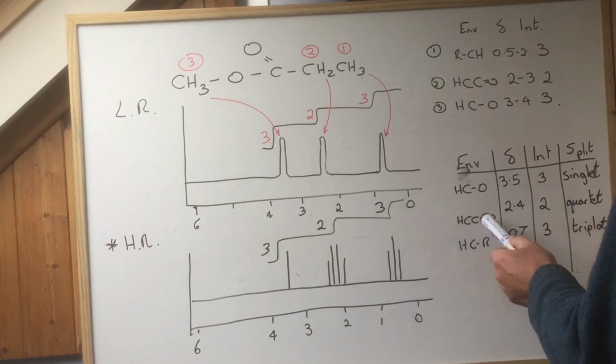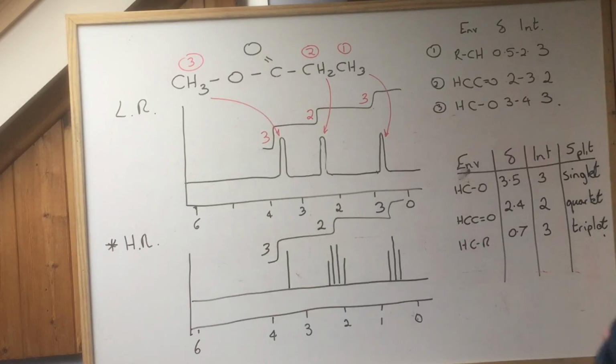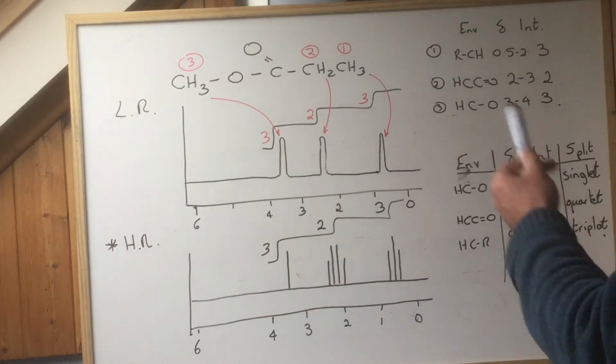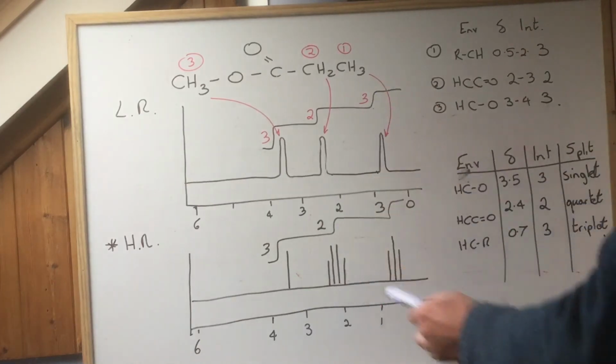So that tells me that those protons there, because they're split into 4, must be joined to another set, an adjacent set of protons, of which there are 3, to split these into 4. So I'm thinking a methyl attached to these 2. That would give me 4.